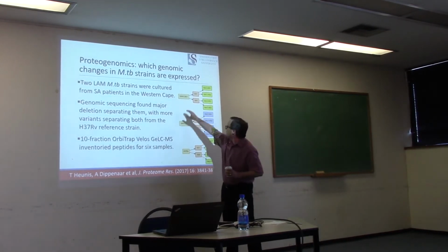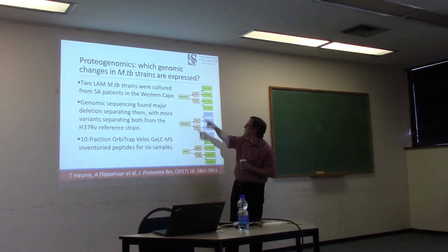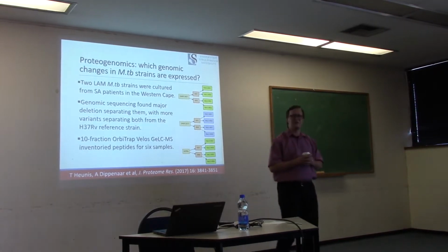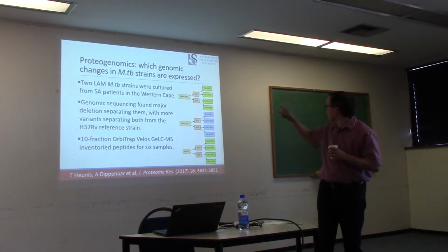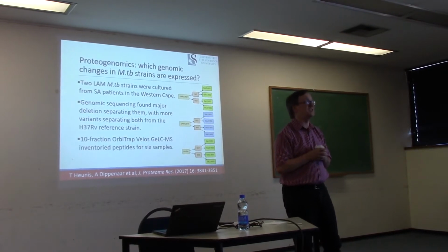We had three different starting strains that I tend to call these saucy, so I hope you'll pardon me. Saucy 3651, Saucy 3517, and H37Rv, which is our common laboratory reference strain. Each of those we produced 2 biological replicates from, and then for each of those biological replicates, we had produced what's called a gel-LC-MS experiment.